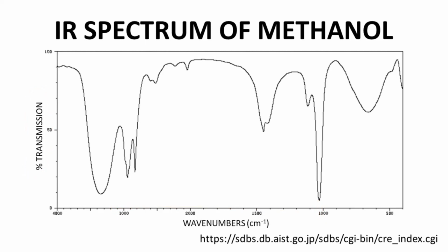This is interesting. For many energies or wavelengths, the molecule does not absorb the photons. Zero absorption corresponds to 100% transmission. The photon simply travels right through the sample. It's when the signal line dips, transmission drops, that the molecule is absorbing the IR photons and undergoing bond vibrations. Therefore, the signals in an IR spectrum correspond to the dips, which are called absorbances, although I will call them peaks sometimes. Just remember that in IR, the peaks are down, not up.